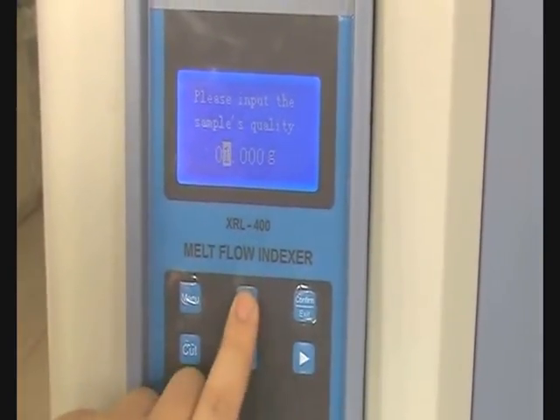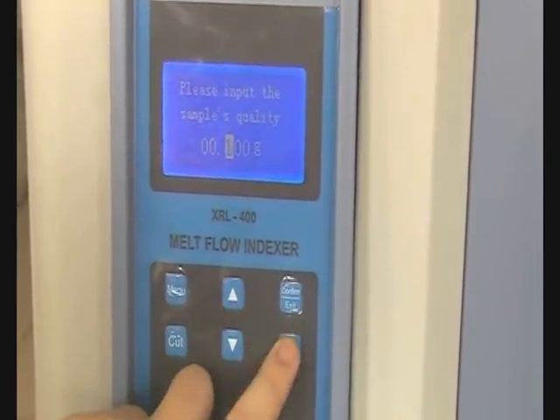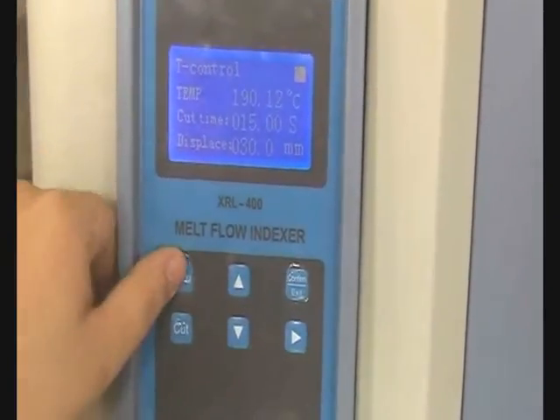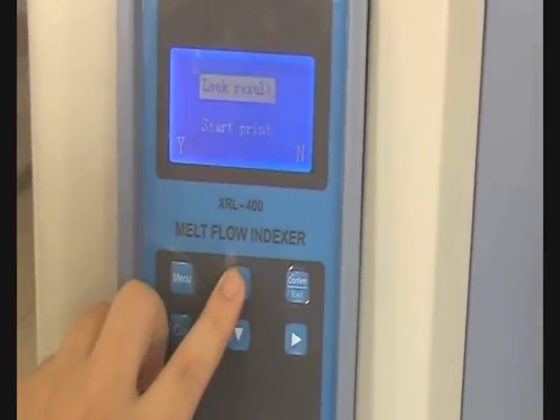If there isn't balance, you have to adjust the quality like this. Press the menu key to enter the custom setting. Here you adjust the quality by these keys. The method is the same as temperature setting. After that, press exit to return to the finished interface.